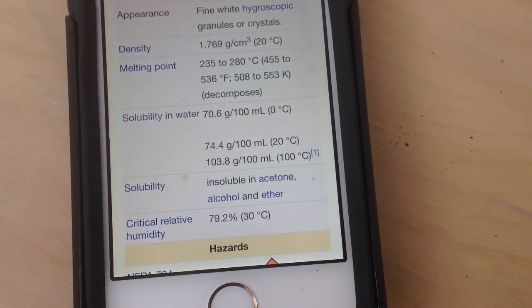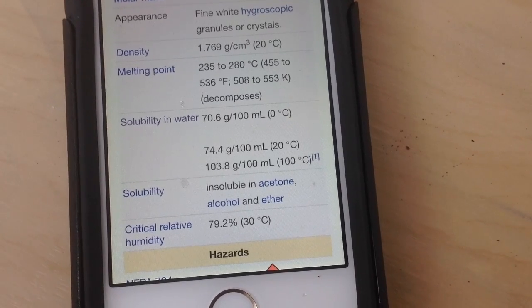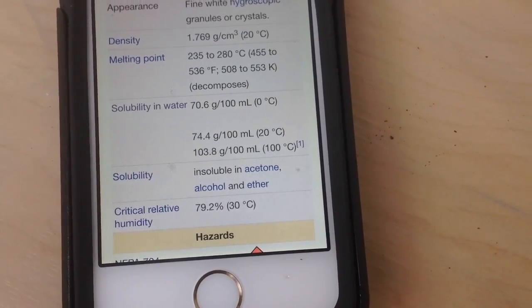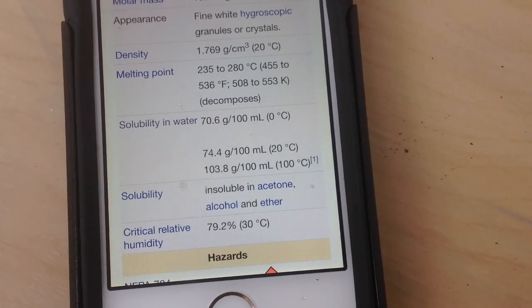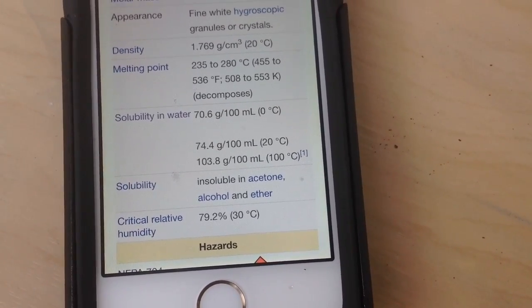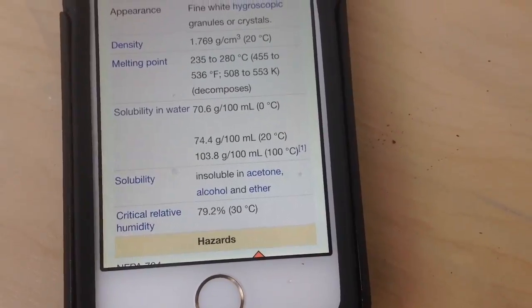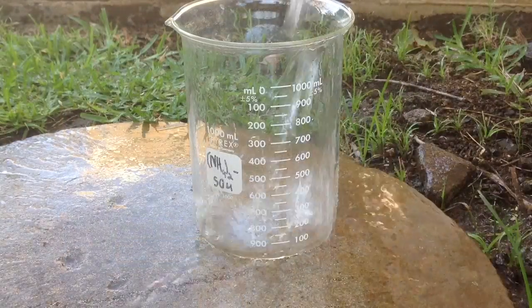As you can see on the screen, in the chart showing solubility in water at the bottom, it says that in theory 103.8 grams of ammonium sulfate can be dissolved in boiling water. But for me, I had to use 500 milliliters for 200 grams of total fertilizer.